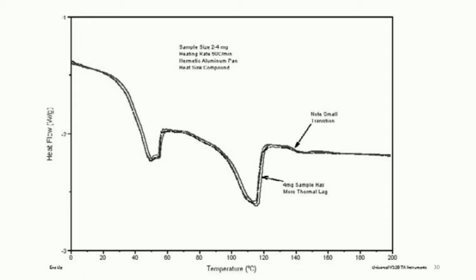Since the pure drug has a heat of fusion of about 98 joules per gram, this means that the microspheres contain about 13% crystalline drug.